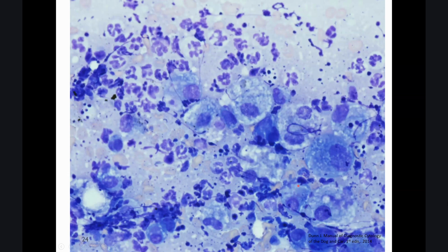So for every cytology, you have to see the bigger picture. Sometimes you're gonna ask, Dr. Stephen, what's going on in the right upper here? What is this one? I don't know about this one. You don't need to know every single detail. The thing that you have to know is to see the big picture of your cytology.